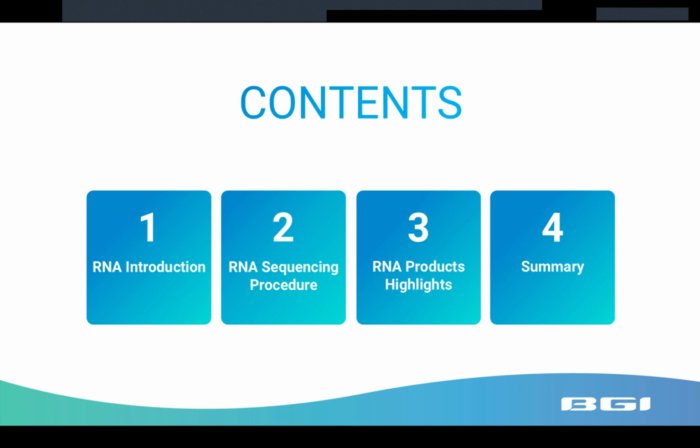The first part is an introduction about RNA. The second part is about the RNA sequencing procedure. This is the most detailed part. And the third part is highlighted features for RNA sequencing. And finally, I will summarize what you should consider when starting an RNA project.